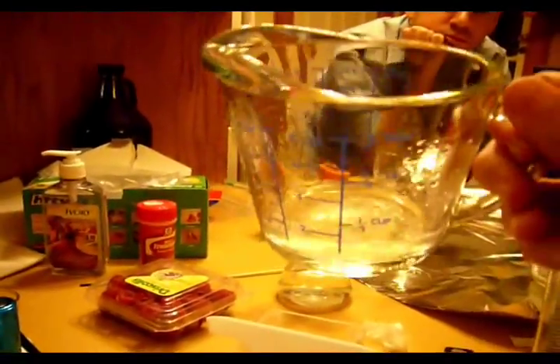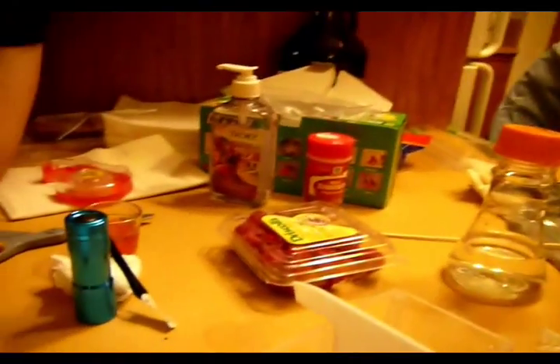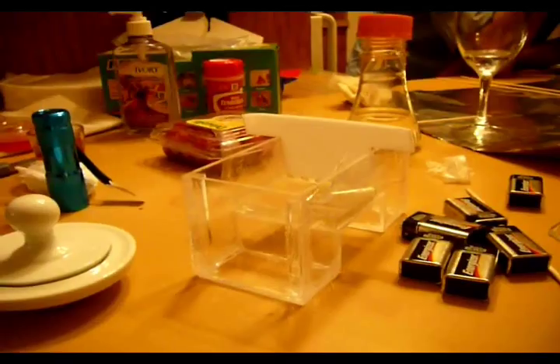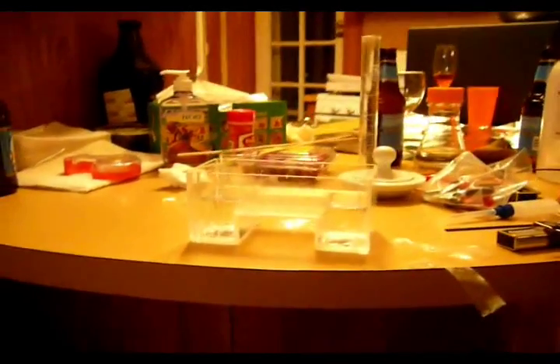So we actually managed to pour this — from this glock. We filtered it through the cheesecloth because the agar substitute was not nearly as nice to work with as actual agarose. Our little gel box — all full of liquid and ready to load. I'm so proud of it.